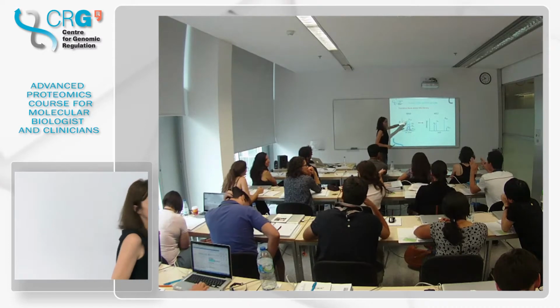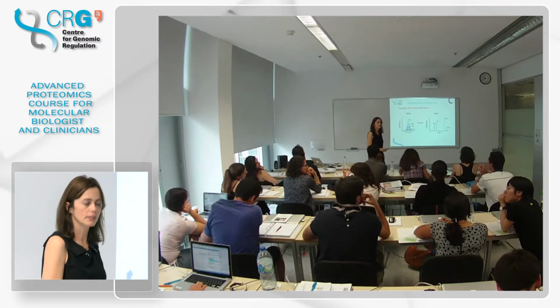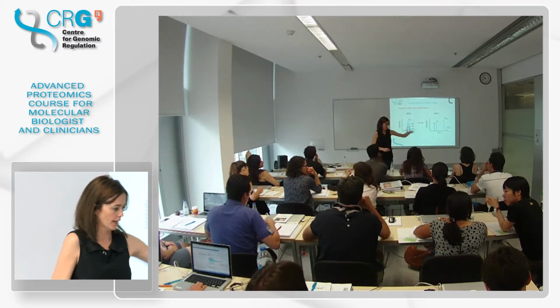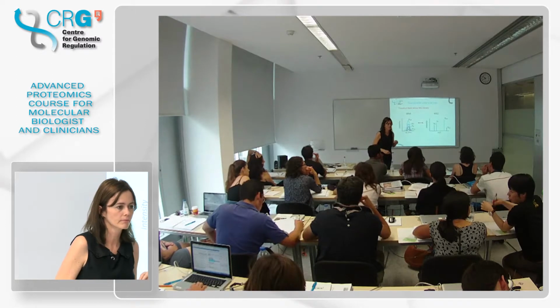Yes. But I don't understand this library for MS2. Is that theoretical or not? Yes, or you acquire the data and you have this information. So is it possible that the intensity of the heavy is not the same as the intensity of the light, or you find a different intensity? Yes, it can be. The response is the same. The final intensity can be different because the heavy you will always have, and the light maybe only in some samples. Yes, the response is the same.